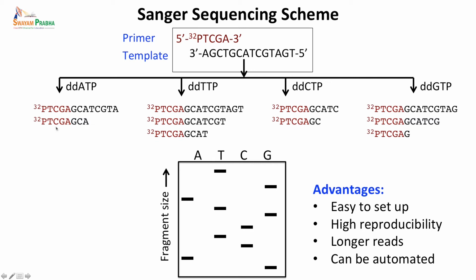So essentially what is going to happen is that in each of these tubes, depending on the sequence of the template, products will accumulate which are of different lengths, because a dideoxy nucleotide can be put in this position, for example, ddTTP. Supposing a ddTTP was put in this position, this chain will terminate. However, if a normal dTTP was introduced at this position in another cycle, then this can elongate further. And supposing at this position you have another ddTTP, then it will not elongate further. And so you will generate these possibilities of different fragments in each of the 4 reactions.